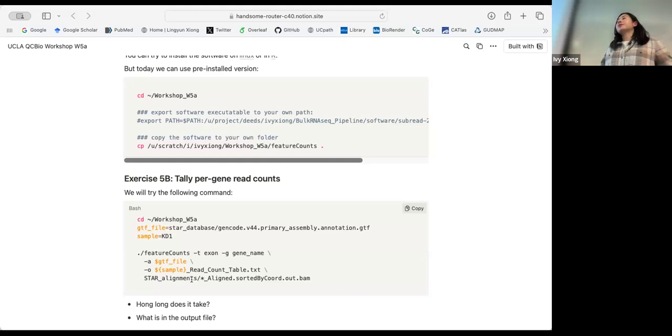The result will be a giant table, basically, with specific genes in each row and samples in each column. Biologically speaking, the KD1 and SC1 data sets should be using the same genome, right? We're using the same annotation files, so you cannot combine the mouse and the human data. Ideally they come from the same experiment, with different conditions of the same experiment, but it doesn't matter.